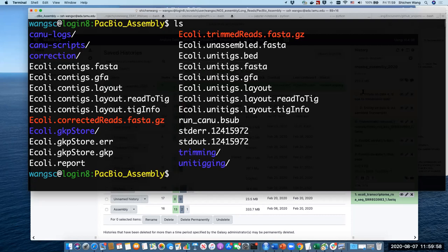So anyway, today you saw a few things about genome assembly, transcriptome assembly, and we tried a little bit on HPRC. If you have real big data for PacBio or long-read, you can try it on HPRC. We have a lot of resources. We have really big nodes with 1,000 GB and 2,000 GB memories. Those are really good for de novo assembly of long-read data.